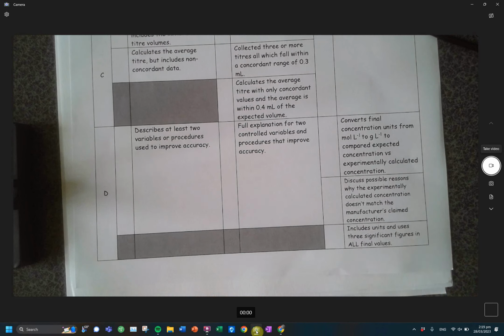And then the last thing is part D. Part D is a written section. This is, again, like another shot to kind of show your understanding if you make a mistake in part A, which is really good. It's a nice little backup. And what you're basically doing in part D is reflecting on your experimental procedure. So you're looking at part A, you're asking yourself, did you actually make a good method in part A?